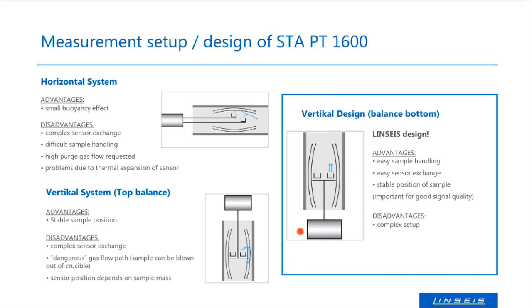However, the construction is a little bit more complex, and it's a little bit more sensitive to vibrations and environmental movements than a hanging device. However, this is the design that has the most advantages for us, and this is why we decided to use this one.